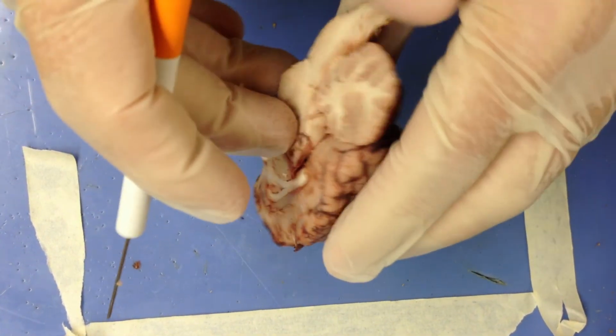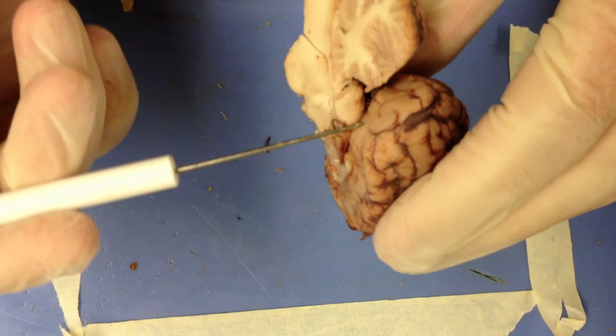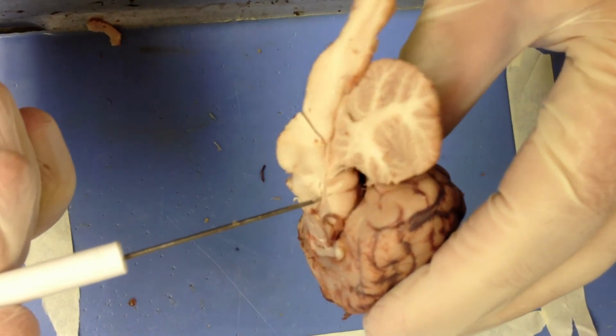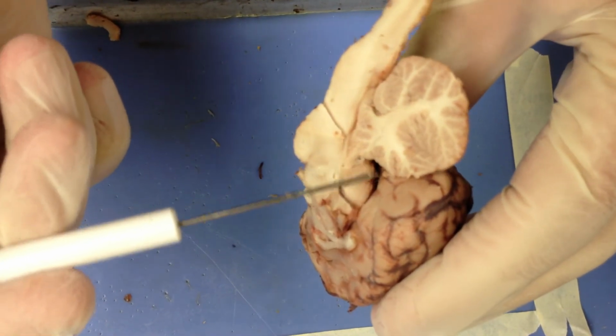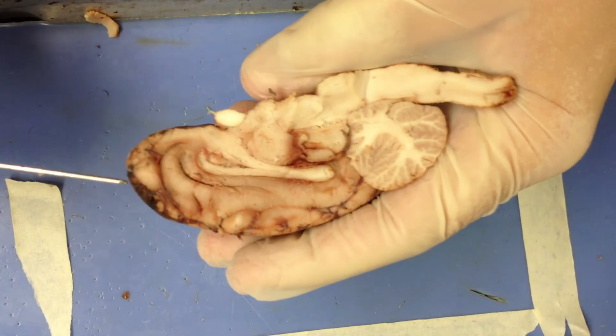I'm going to turn it this way so we can see the two colliculi. We have the superior colliculi, which is going to be this ball right here. And you can see there's a little dividing line right here that goes across it. Below the superior colliculus is the inferior colliculus. And that should pretty much sum up the mid-sagittal view of the brain.